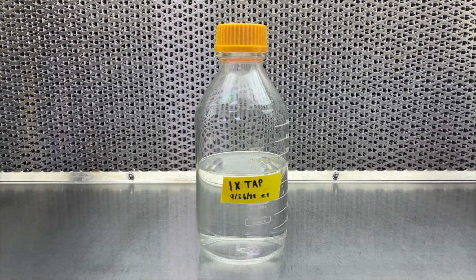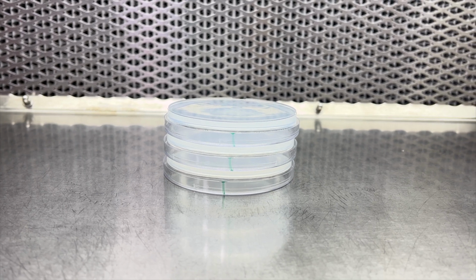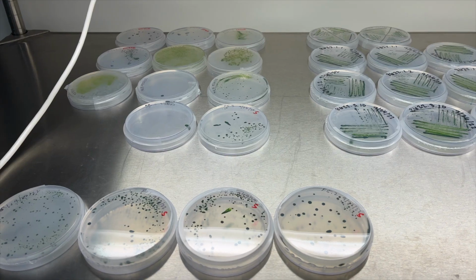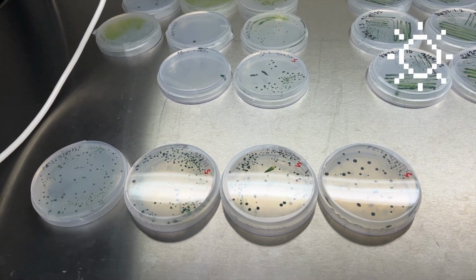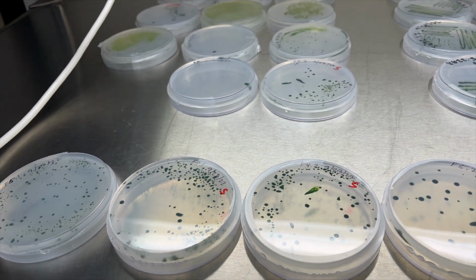9. After the 24-hour cell recovery period, centrifuge the contents of the shaking flask down into a pellet at 3500 G for 10 minutes. 10. Discard the supernatant and resuspend the pellet in 1/100th volume of tap as you had used previously. Dispense the resuspension onto a selective tap agar plate and spread it evenly across the surface of the plate with larger plating beads. 11. Parafilm the plates to prevent desiccation and place them under direct light. Colonies should appear within 5 to 14 days post-transformation.